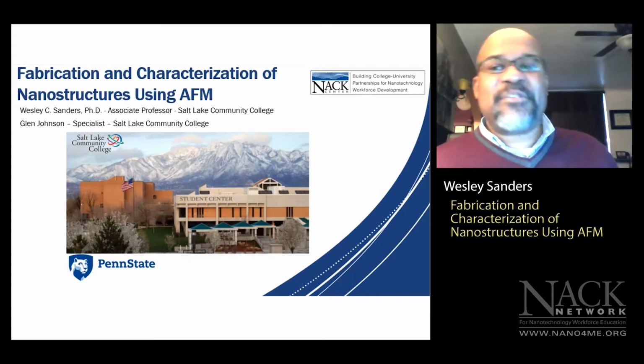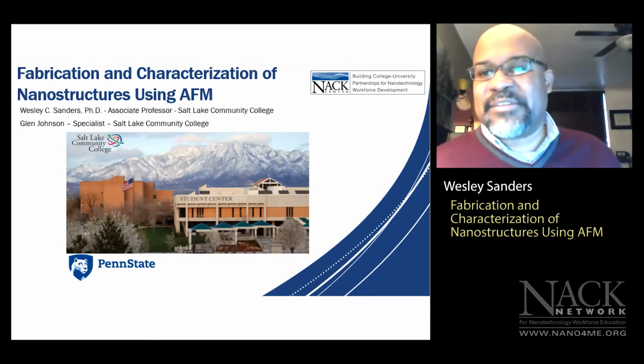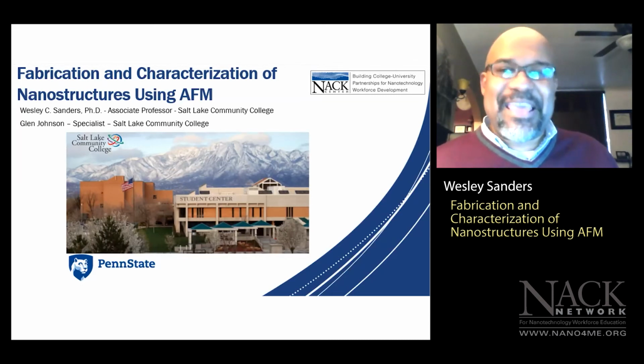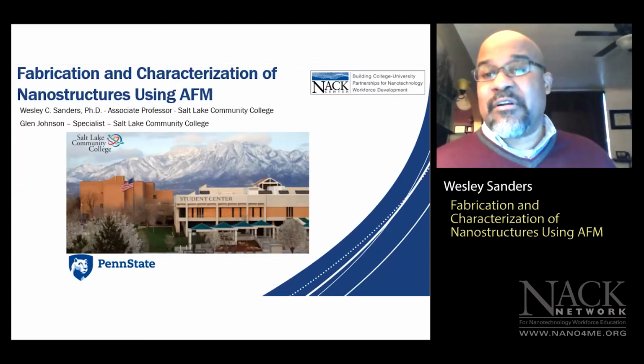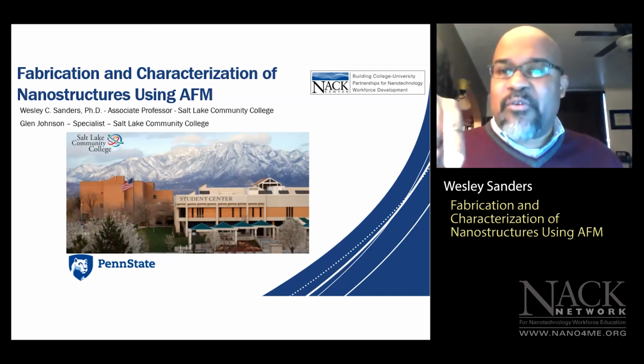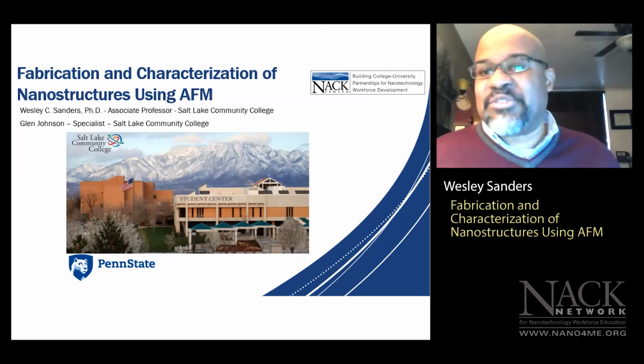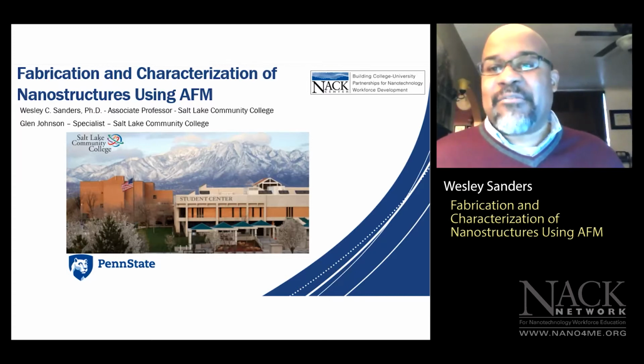The atomic force microscope is just one flavor of scanning probe microscopy. Scanning probe microscopy, or SPM, is an umbrella term. It involves the use of a specialized probe to sense a signal on the surface of a substrate for the purpose of characterizing nanoscale and microscale structures.